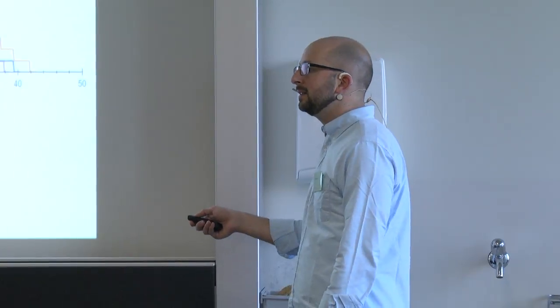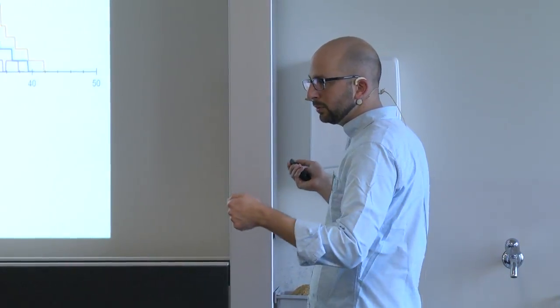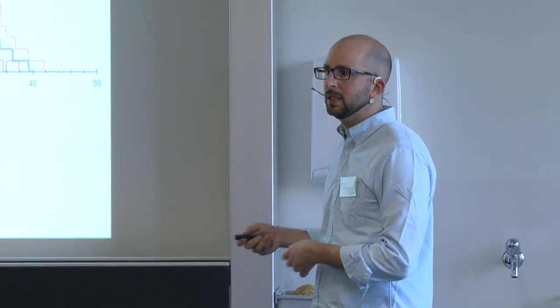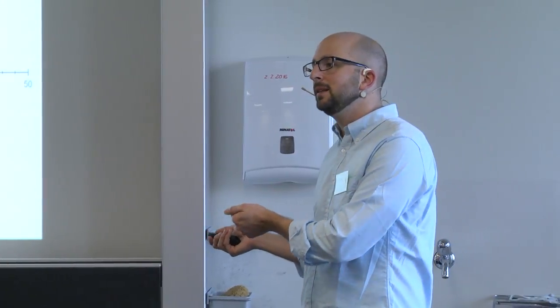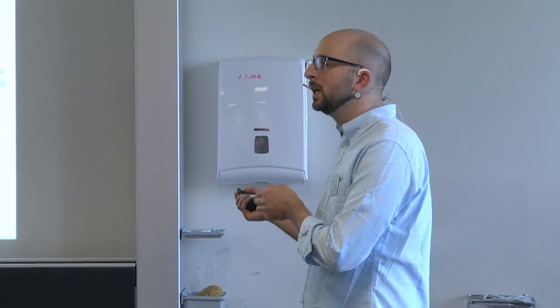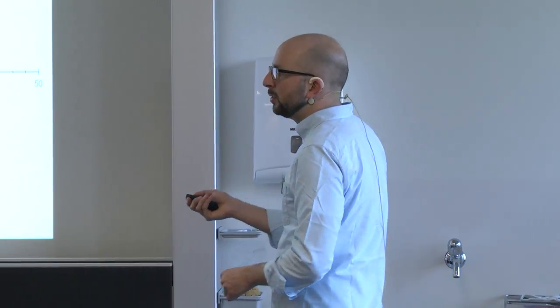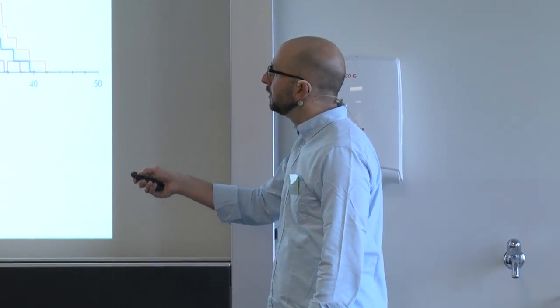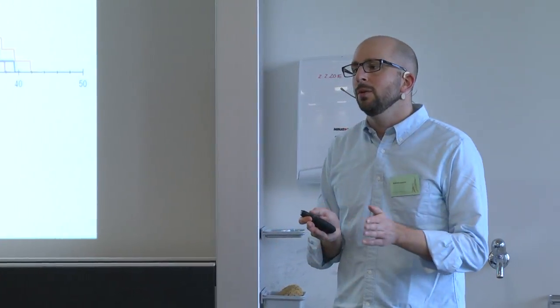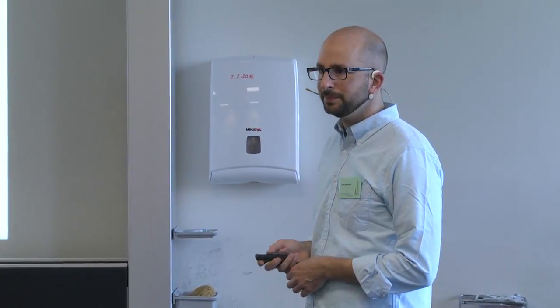So if now I take this information and I go to a gradient which is 2 times bigger, this plot will look different, but it needs information in order to do these calculations. But it's a very useful, handy thing when you just want to get to a certain minimum level of sensitivity, or you would like to make a more informed choice about how many injections you need to do. Then you can use these plots to set these values, and then you know how many injections you need to do and what's going to be some information about your sensitivity. Okay.